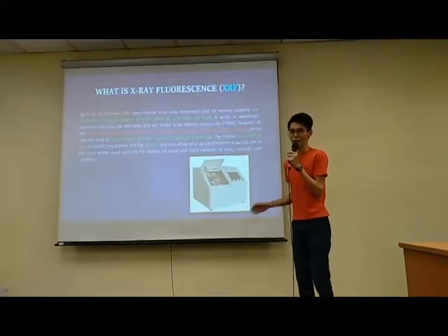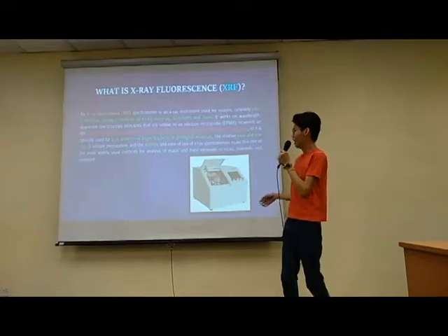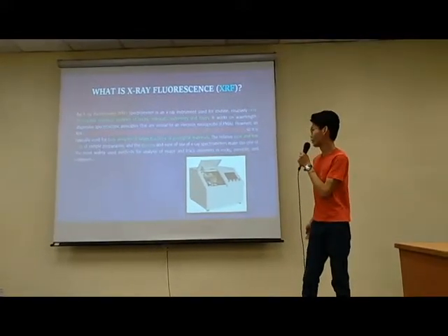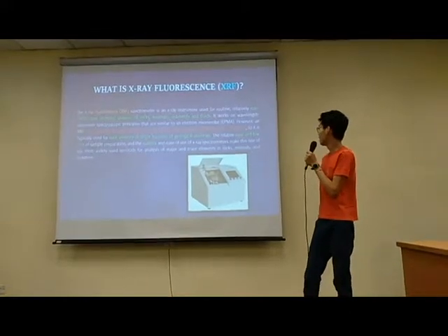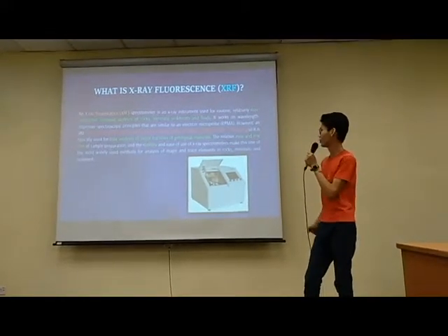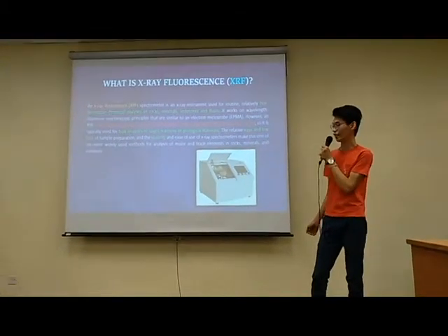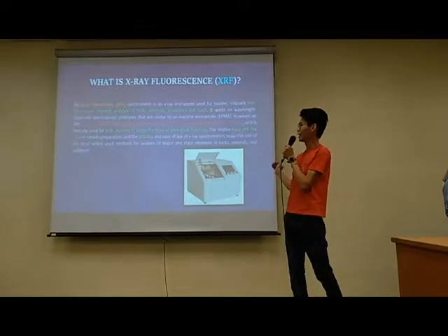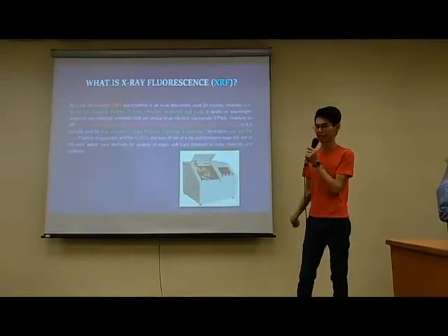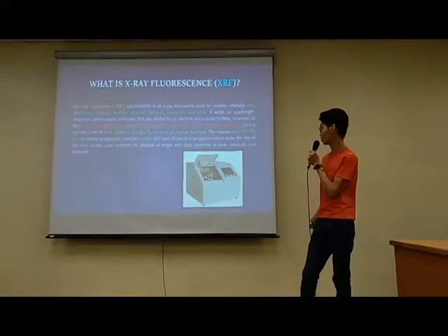Now, what is X-ray fluorescence, XRF? An X-ray fluorescence spectrometer is an X-ray instrument used for routine, relatively non-destructive chemical analysis of rocks, minerals, sediments, and fluids. XRF cannot generally make analyses at small spot sizes, typically of EPMA works at 2 to 5 microns.